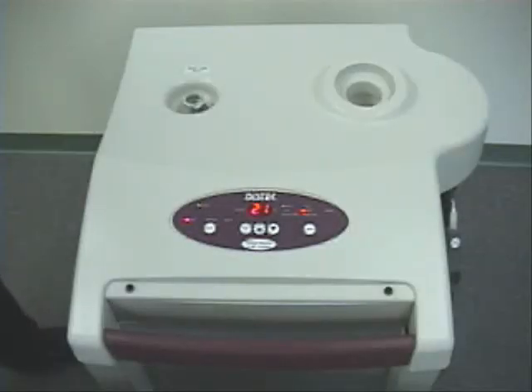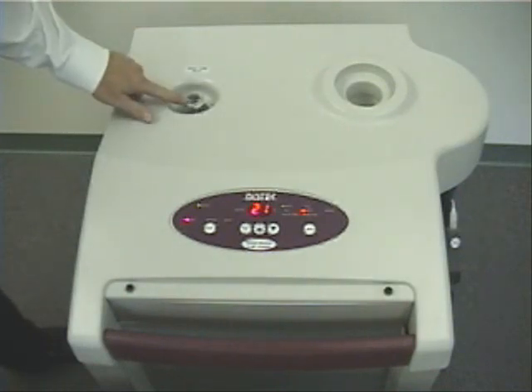I will now point out the key components of the VIP4400. Beginning at the top of the unit, there is a quick connect port for filling the rinse tank.